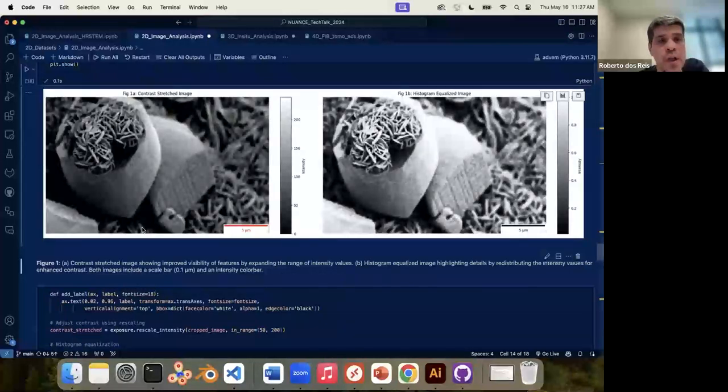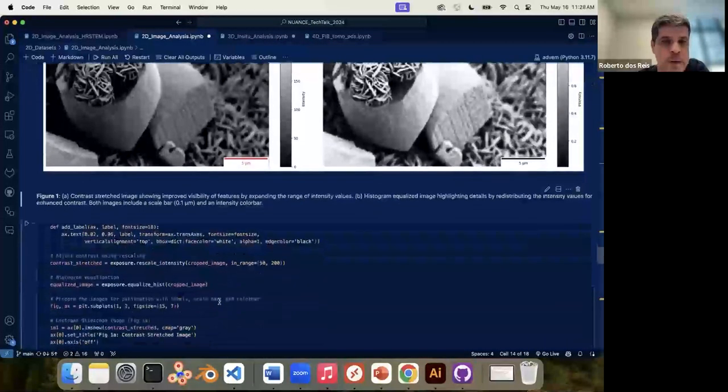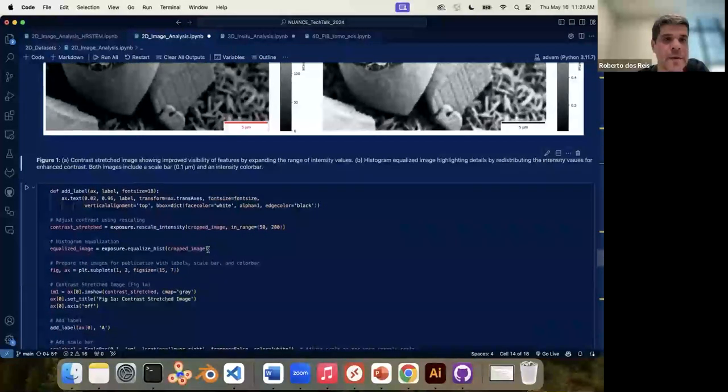So you can do your whole image processing, for example, that goes in your supplemental information in your paper like this, and then the readers can reproduce the way that you plot your data, which is very useful. And it helps the community to validate your results as well.